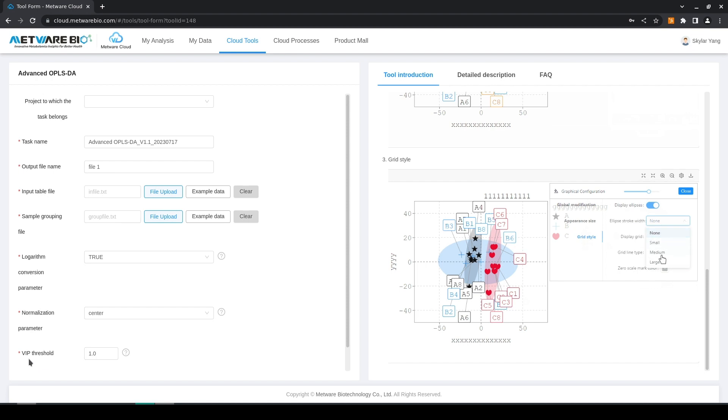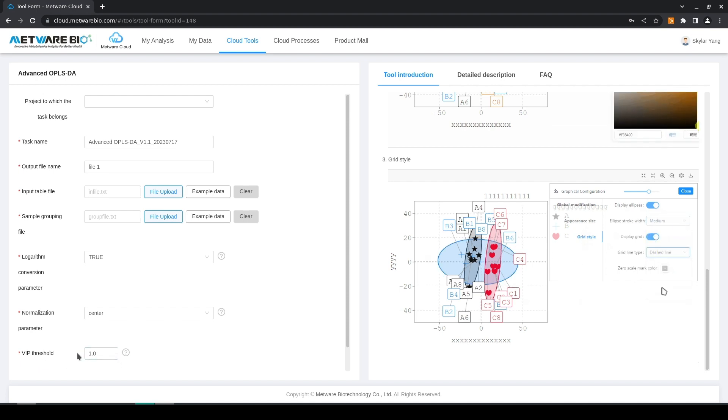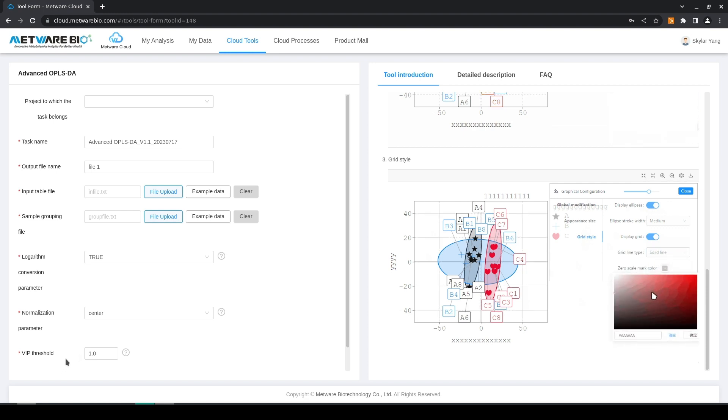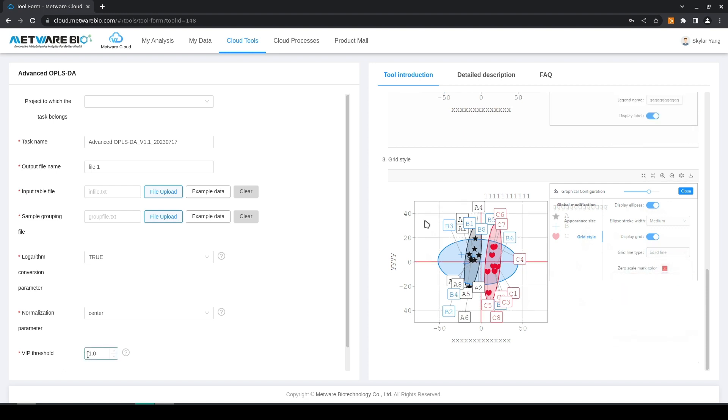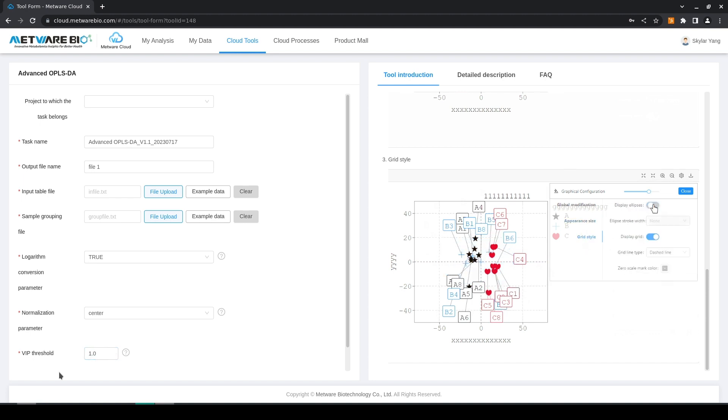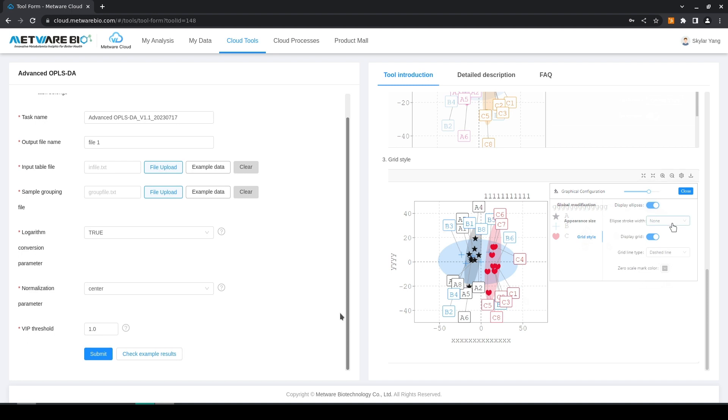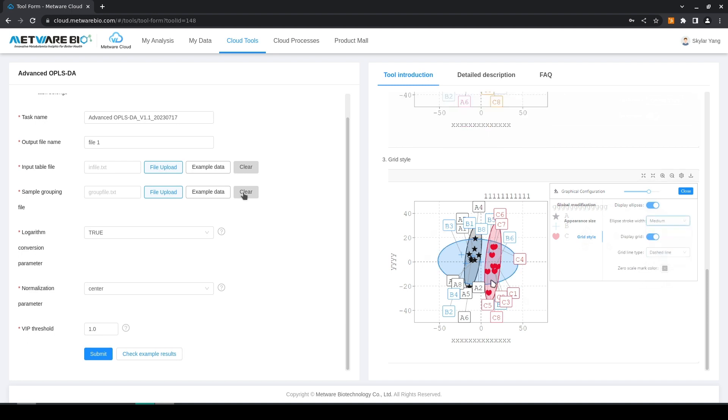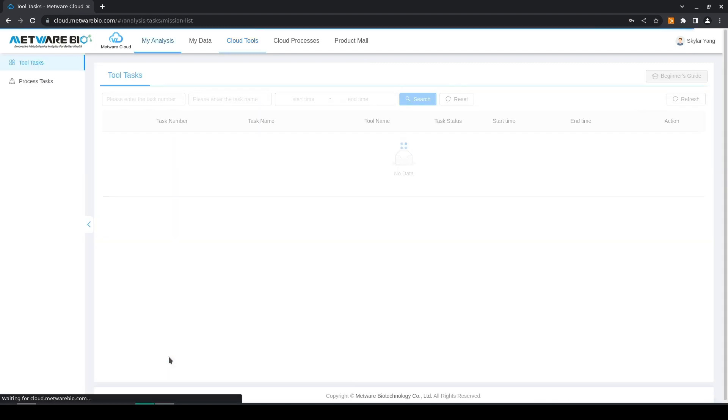The last parameter is the VIP threshold. This can be edited, and from a graphical point of view, values that are above this threshold will be color coded red while everything else will be black in the final output. After you are done you can just hit submit and then later check your results.